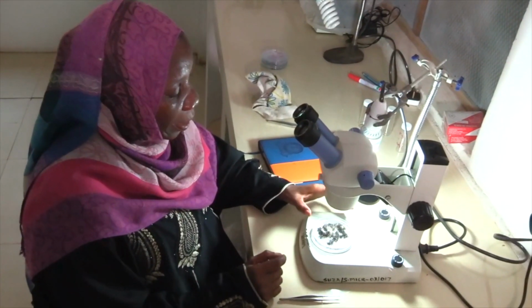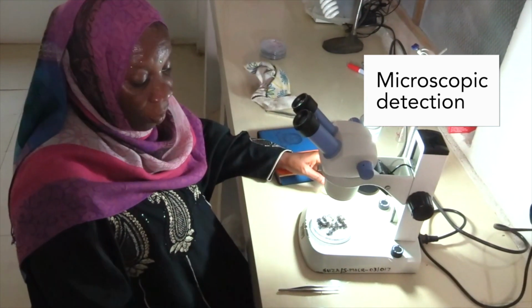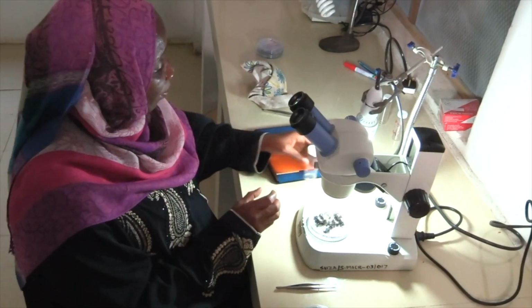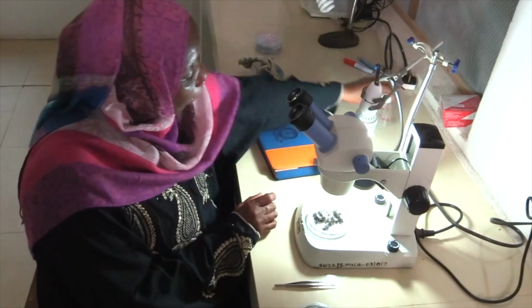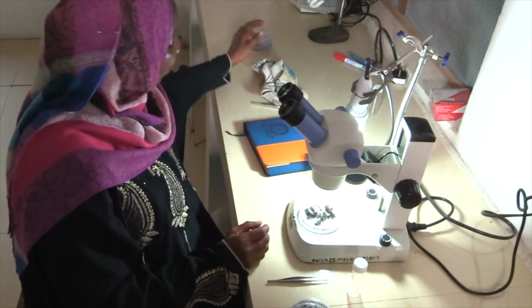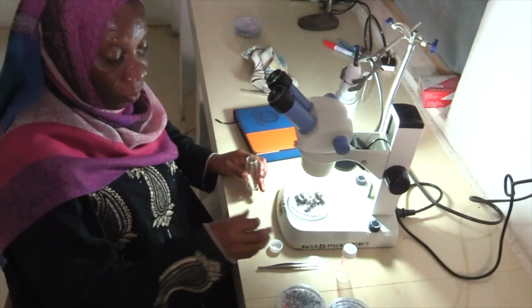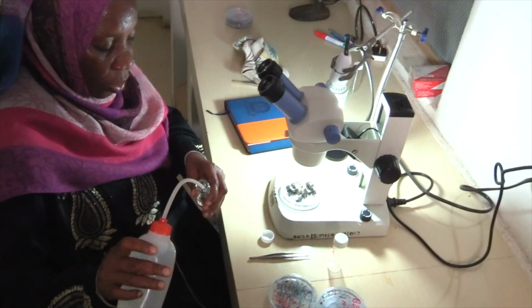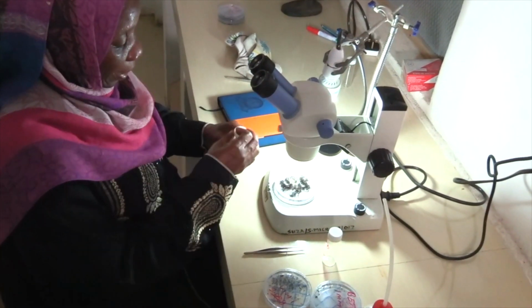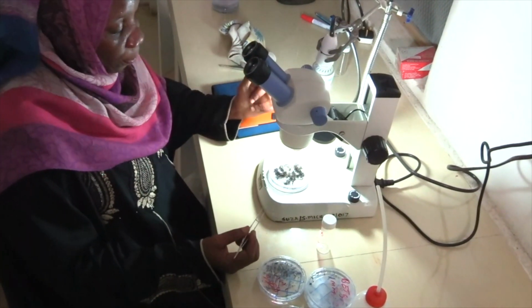Now we start with the microscopic detection. As you know, we have 2 samples. This is 1 millimeter, and we should have a 1 millimeter vial. This is 0.3, and we should have a 0.3 vial. Also, we put in some fresh water, not full, just half is enough. Then we start to find whether they are plastic or possible plastic.